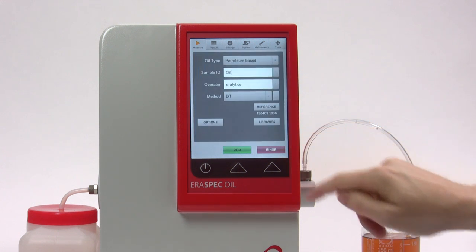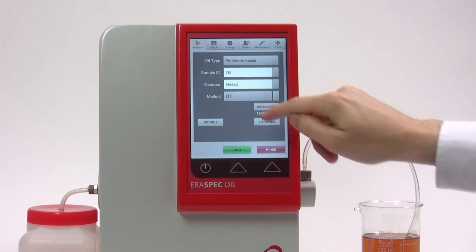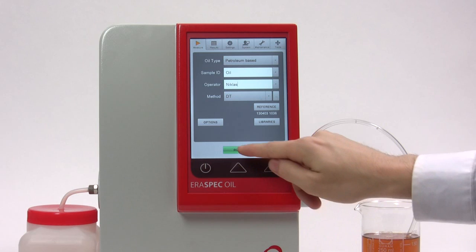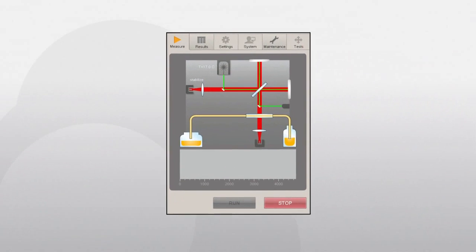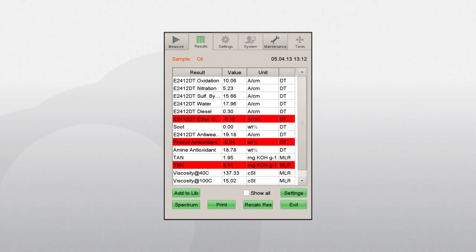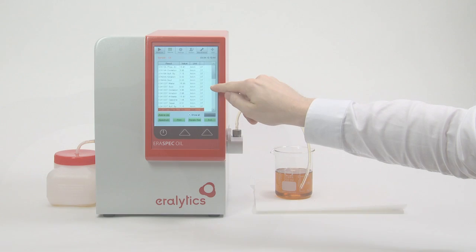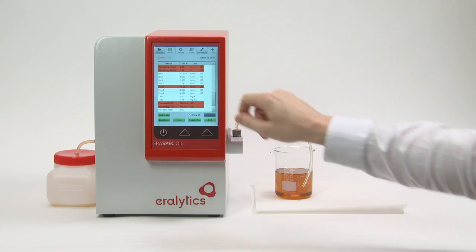Or select stored names from the drop-down menu. To make a measurement, insert the inlet tube into the sample container and click Run. This will activate the automated measurement sequence. After the measurement has been completed, the results will automatically appear on the screen. All available ASTM, JOAP, and DIN standards will be calculated together with TAN, TBN, viscosity at different temperatures, and viscosity index.